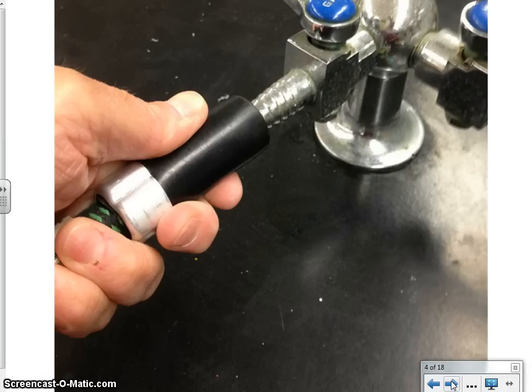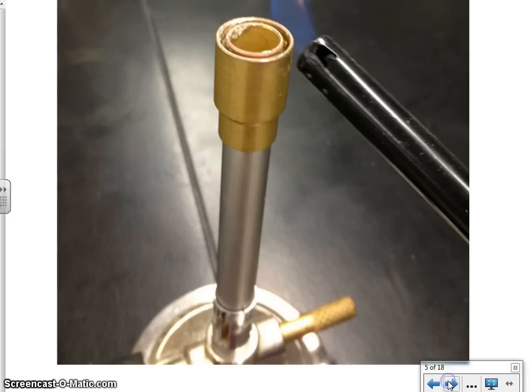To perform this lab, you're going to need to know how to use the Bunsen burner. The Bunsen burners can be found in the cabinet that is in the lab bench. Find a Bunsen burner, and your first job is to make sure that the hose is securely fastened to the gas jet as shown here in this picture. To light the Bunsen burner, you will ignite a lighter, and you will hold the lighter very close to the mouth of the Bunsen burner, like so.